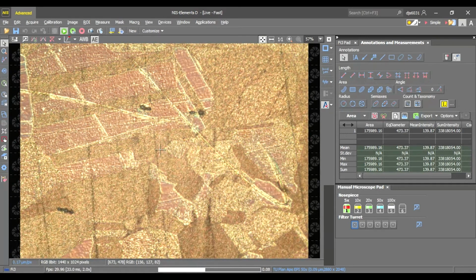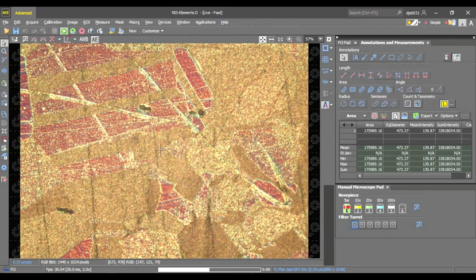On the wheel, there is a white dot. When that white dot is perfectly out to the left of that polarizer, that means that you have, I believe, 90-degree polarized light. So that's about max as far as polarized light can be.